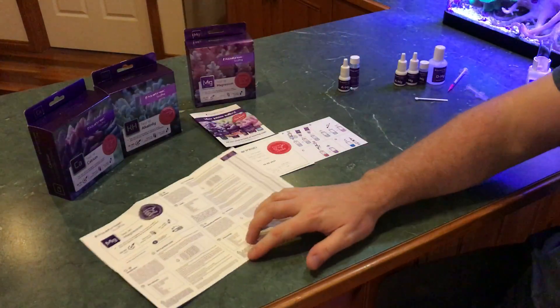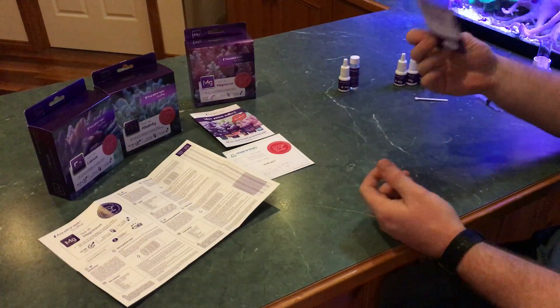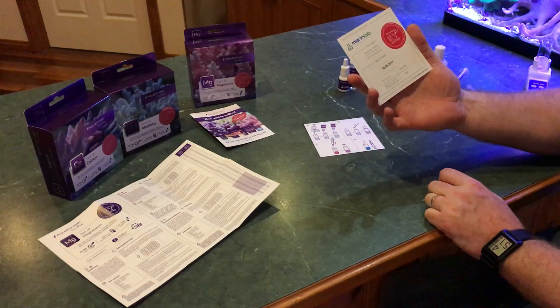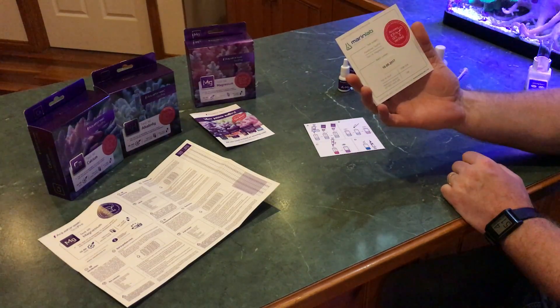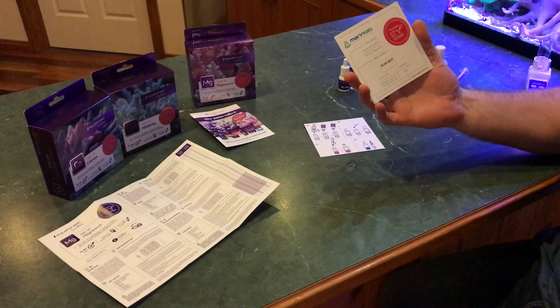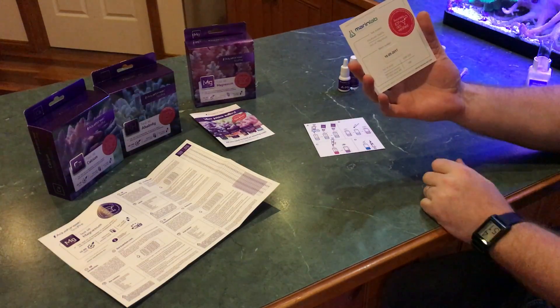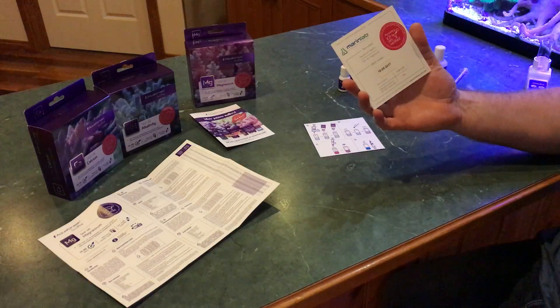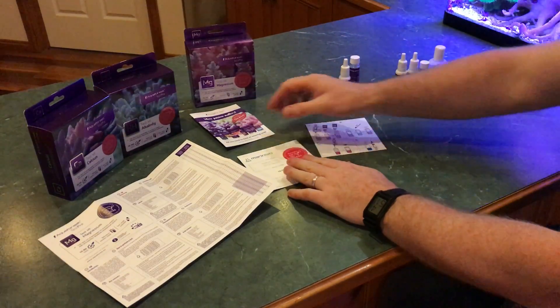You get some waterproof instructions that use pictures instead of words, which is interesting. You also get the ICP verified result, which says this test kit returned a result of 1290 to 1320 magnesium when the reference solution said it was 1310 — so it falls pretty much in the middle. There's a 30 milligram swing from a titration test kit, which is probably acceptable.